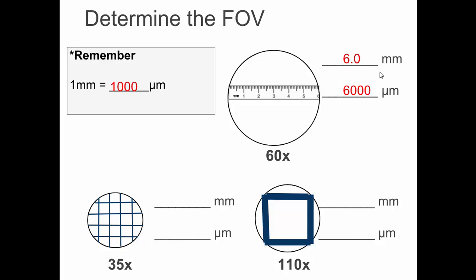If I increase my magnification to medium power, okay, obviously I could see. What we're going to do is we're going to look at graph paper, millimeter graph paper. Like this. So how many millimeters wide is this? 4. 5. At its thickest, 5 and 3/4. Just about 5. You can't quite see the fifth one, but that's close enough. How many micrometers? 5,000.